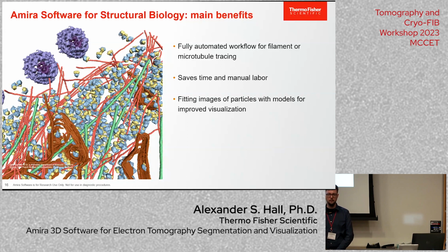So in terms of measurements that you mentioned, could you identify, let's say, in the top left corner, these two nuclear pore complexes? After you segment the whole volume, can you let Amira tell you where the nearest or the furthest points are on that pixel? And how is that achieved?